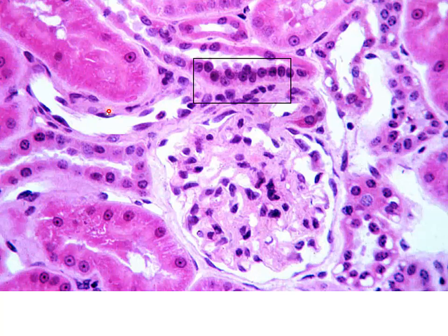Now, at this point, we have an arteriole coming in, and we can see the very flattened endothelial cells of our arteriole. We're going to have another arteriole here in this case. And then you see these really red staining cells that are adjacent to the lumen of the arteriole. These are going to be our JG cells, our juxtaglomerular cells. Now, these are the ones that are going to be detecting our pressure differences that we have here in the arteriole. We can clearly see all of these nuclei lined up very, very closely together. These are going to be our macula densa cells, and we'll probably look at these a little more closely as we go through this as well.